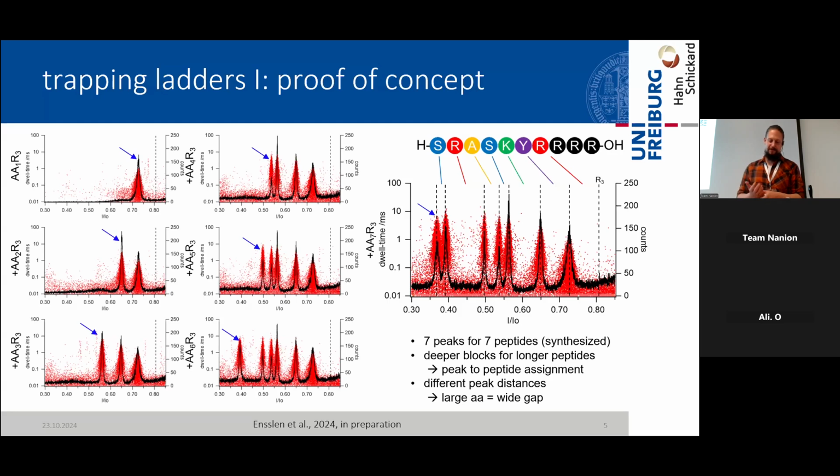Thank you, Niels. This is actually a very good question, and we are already tackling that. What we can see is that with the decapeptide we are almost at the sweet spot of aerolysin. So we can squeeze a bit longer into the pore, like 15 amino acids is also possible. We can get a signal, but we are then less sensitive. So we cannot really measure those very tiny differences or even isomers. Then it's really just, okay, we cleave one amino acid, this is something detectable, but these very miniature shifts in our current blockades are then not detectable anymore. For this, we could come up with the idea of elongating the channel, for instance, and engineer it.